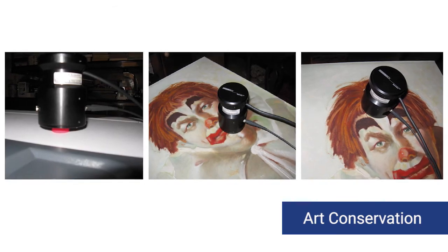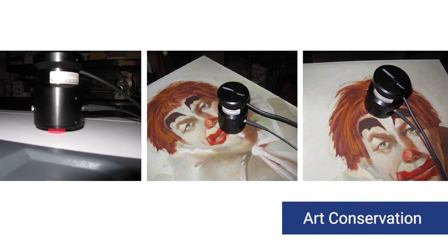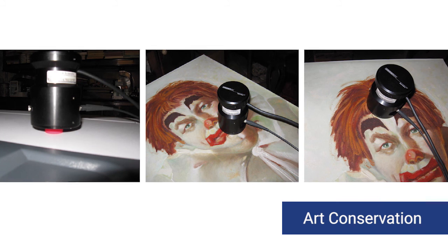Or in art conservation studies, where they're trying to make sure that this is in fact an old painting, because you can determine that by the pigments that have been used in the paint to see whether it's a new paint, old paint, or whatever.